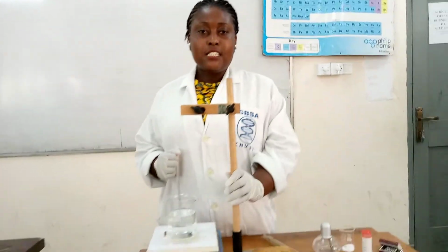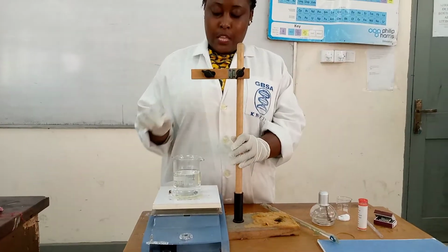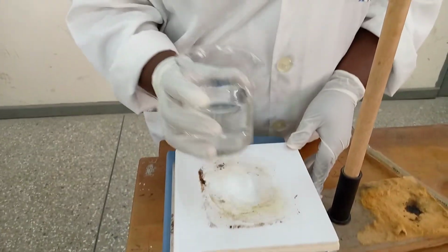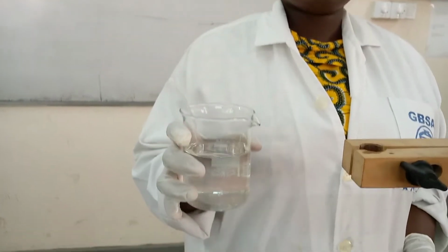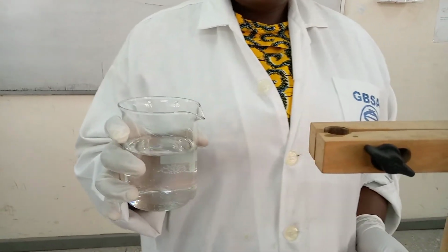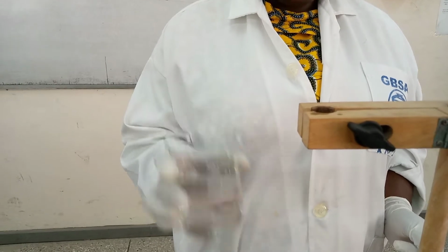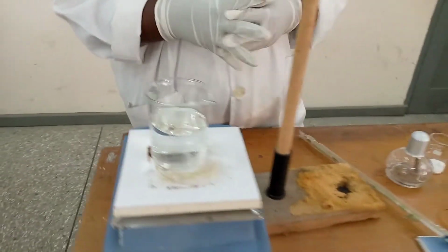And when we come here, this is my Richter stand. This is the clamp. This is my hot plate. And the liquid in this beaker is paraffin oil. It is not water. It looks like water, but it is not water. It is paraffin oil. Okay. So now, the melting point I'm going to do is the capillary tube melting point determination.